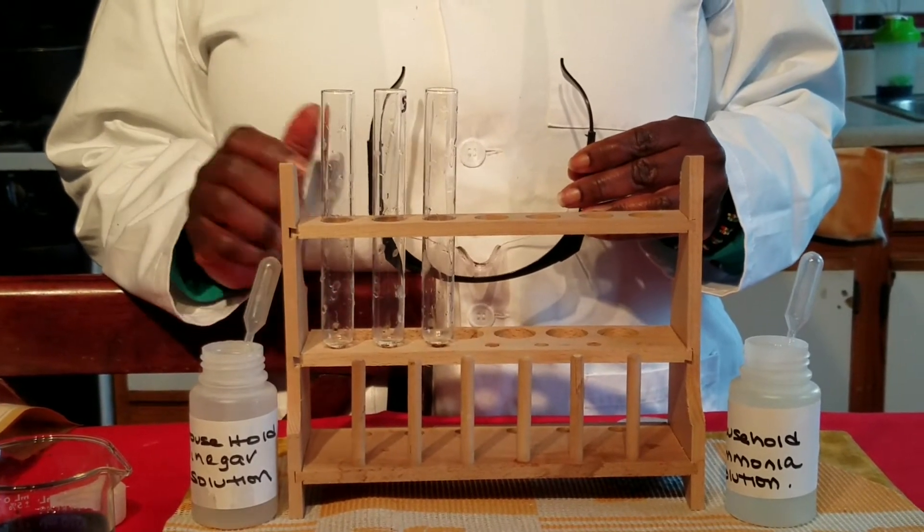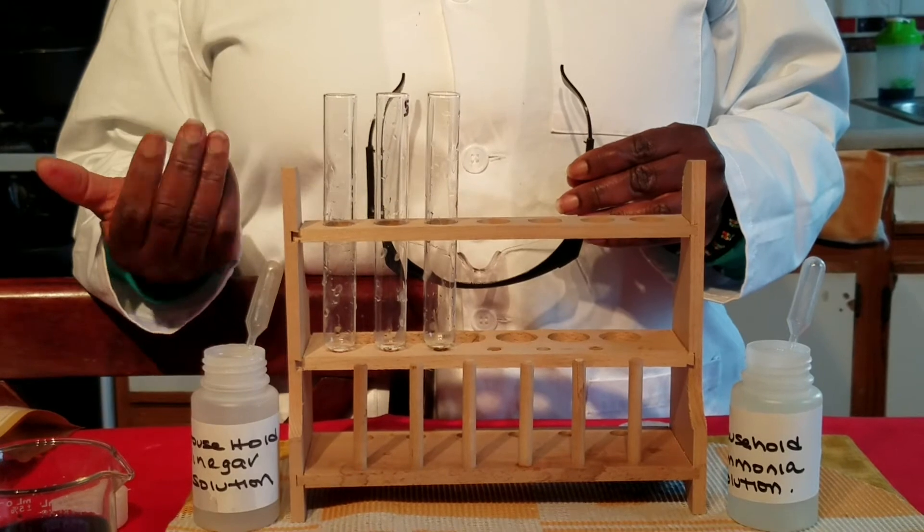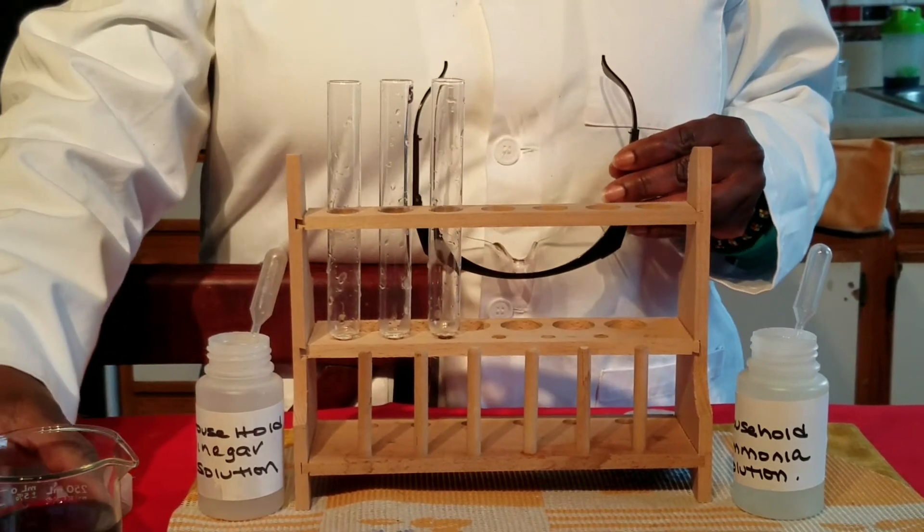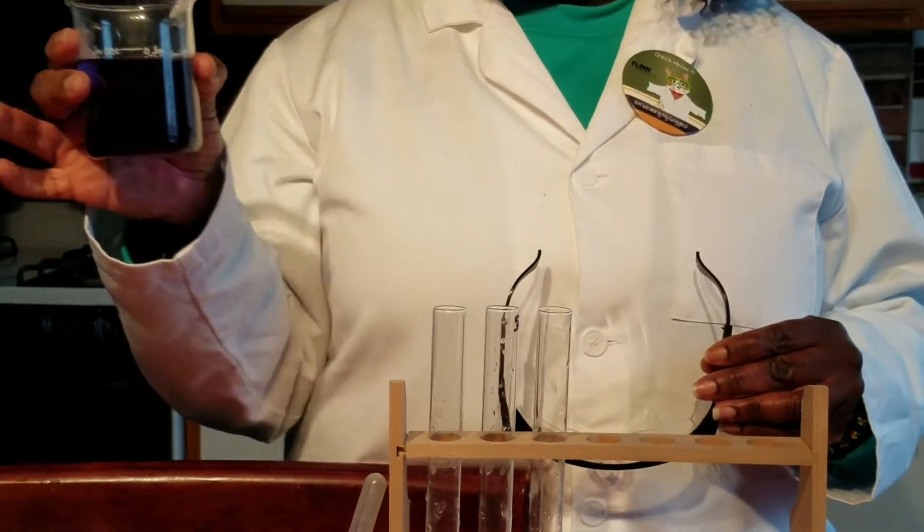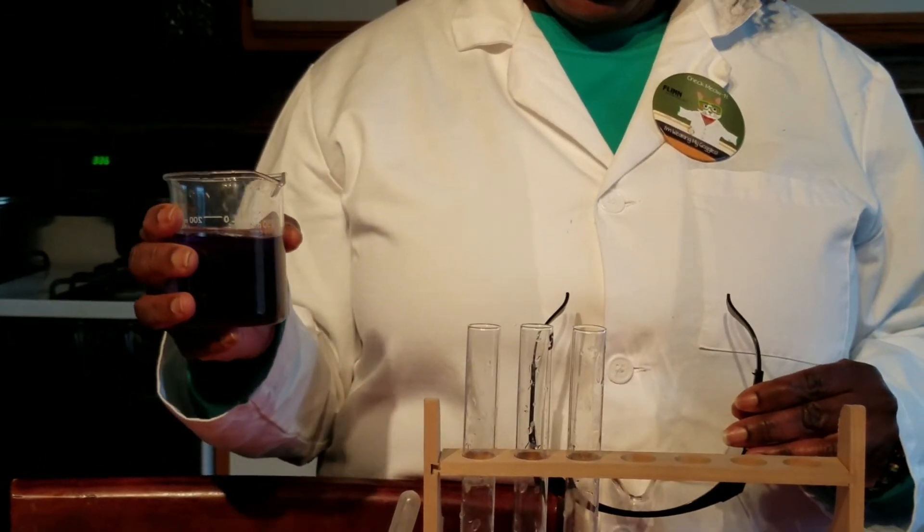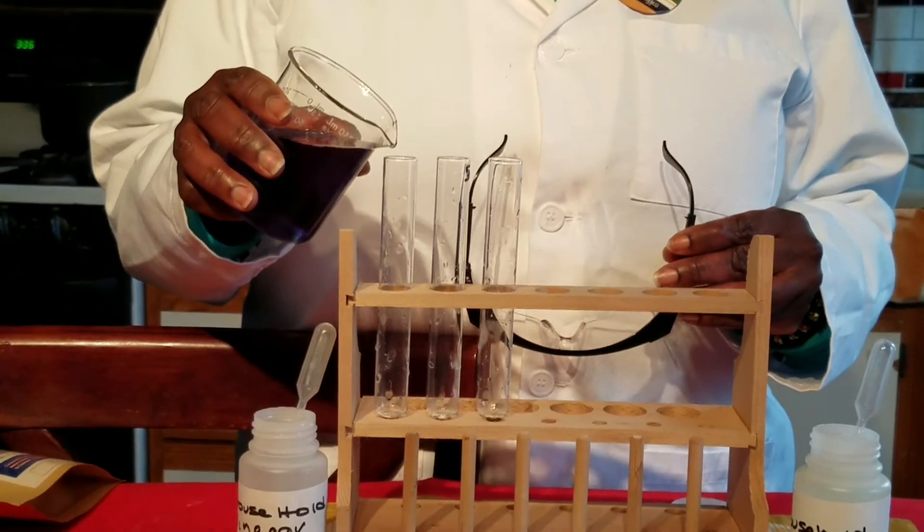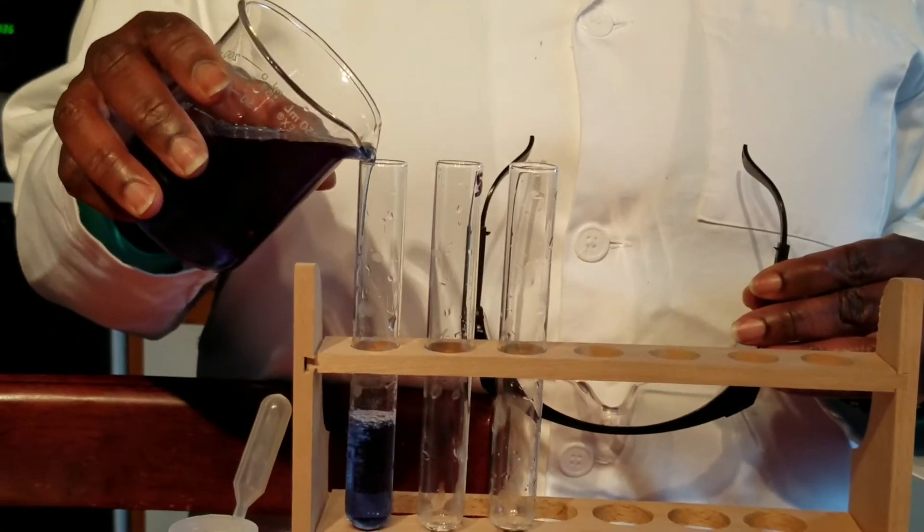So we're going to do the first reaction using tea. Here I brewed some butterfly tea which turns out to be a really pretty color. I'm going to set an equal amount in each of the test tubes.